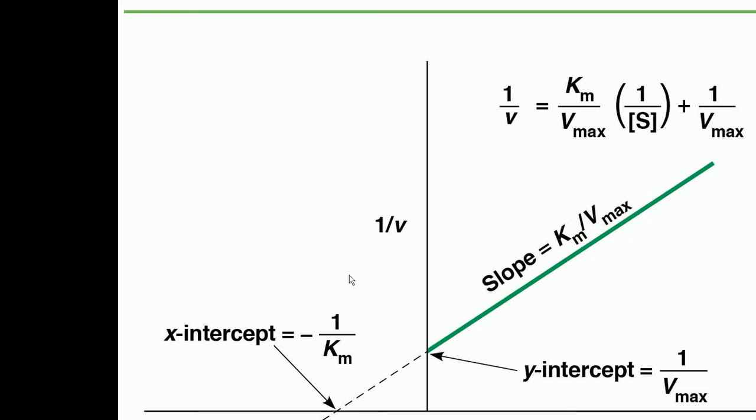And exactly what we are trying to understand from this graph is that with its help, we can calculate the x-intercept and y-intercept. What is a y-intercept? The y-intercept is that point on the y-axis where this trend line crosses the y-axis. And the x-intercept is that point on the x-axis where this trend line crosses the x-axis.